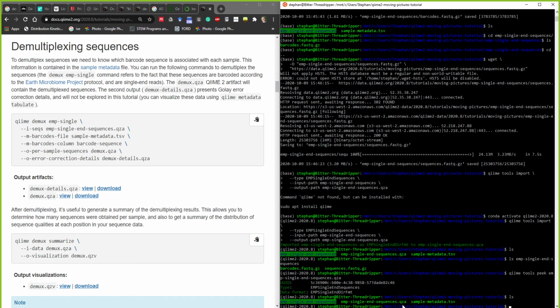I might have missed something somewhere because it says I don't have the moving pictures tutorial. It says no such file or directory. Go in the chat and copy the thing that I just sent to everyone. I did. You did, and you don't have that. Okay. Yeah, I did that because it's faster than me typing it.